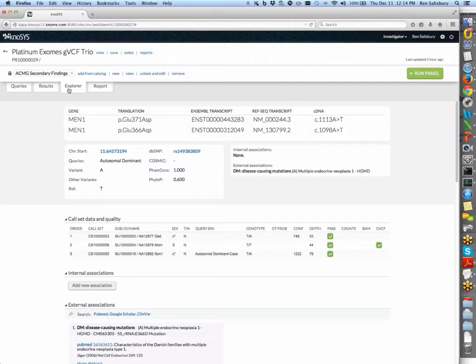So we've gone from the results table into a focused representation of the single variant. And so here we have a somewhat easier to read representation of all of that data. So here we have the gene with its 2 different translations according to the transcripts. And as you can see, we have a lot of hyperlinks within the system. So this would take us out to the UCSC genome browser or to dbSNP, and it would simply open them up in another tab in our browser. So conveniently keeping all of that information together. There's been no internal assessment of this variant yet, so nothing stored on this particular Gnosis machine about that variant.